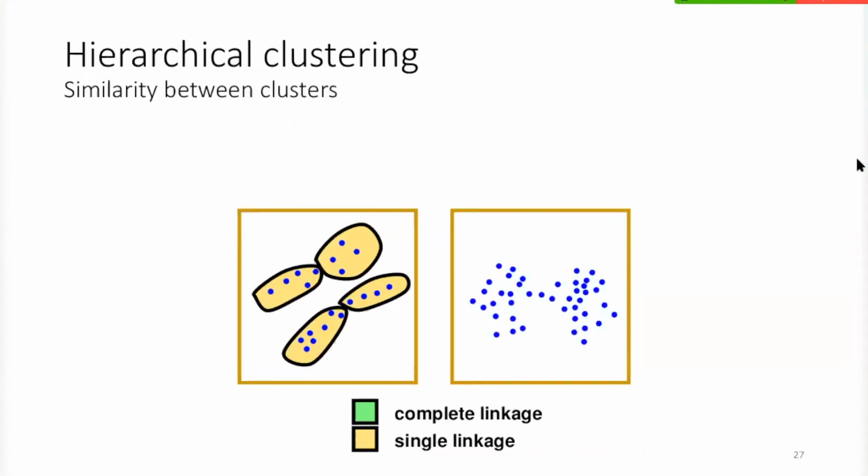Okay, so let's have a small exercise. So I have the points here on the left, so we focus on this for now, and I have already grouped them in these 4 groups. So I stop at this level, and I want you to think, like, if I want to now join them based on complete linkage, which 2 groups would be joined? So should I now group this with this, or this with this, or this with this one? This and this. Yes, that's true.